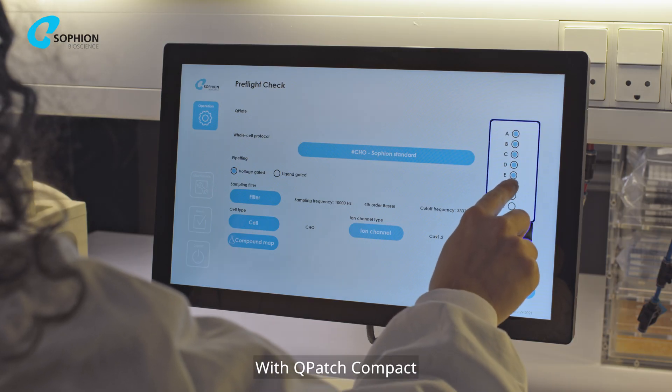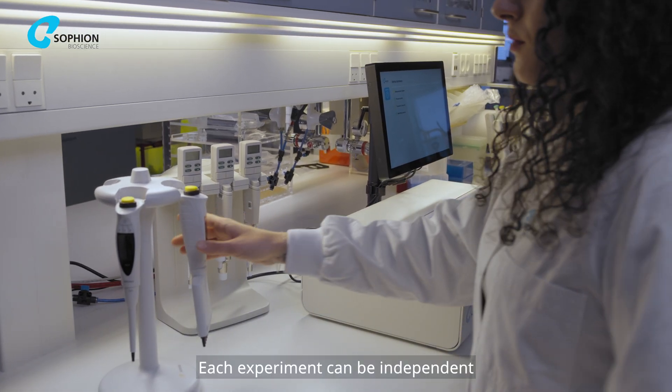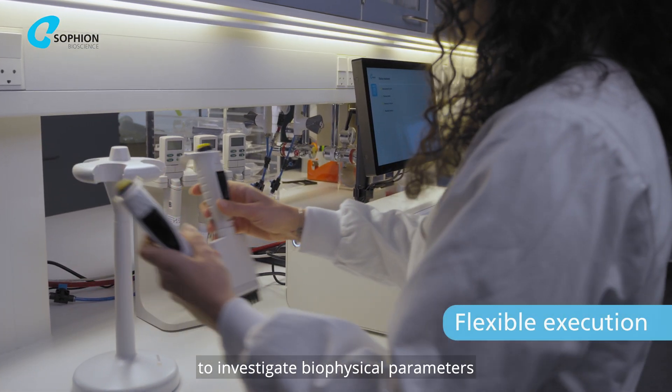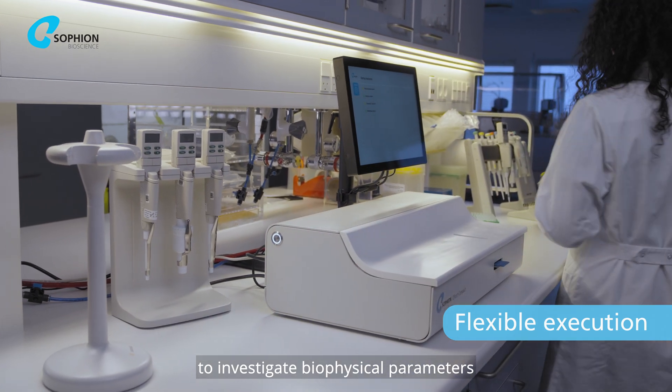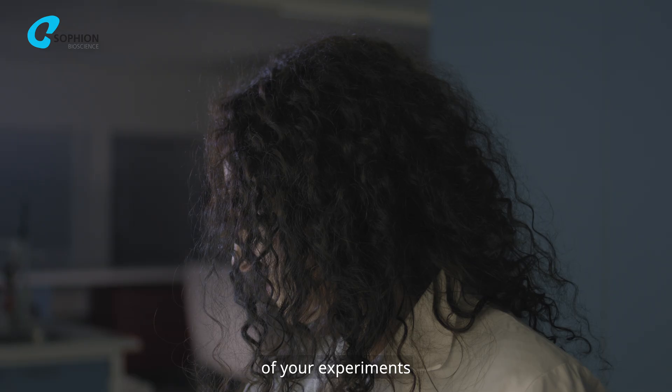With Q-Patch Compact you can conduct up to eight experiments at the same time. Each experiment can be independent to investigate biophysical parameters, or they can be replicas to increase the statistical power of your experiments.